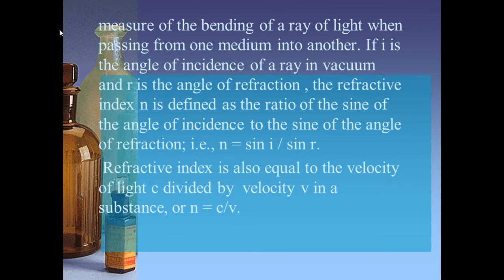So what is refractive index? It is a measure of the bending of a ray of light when passing from one medium into another medium.